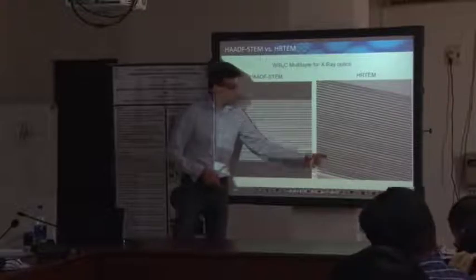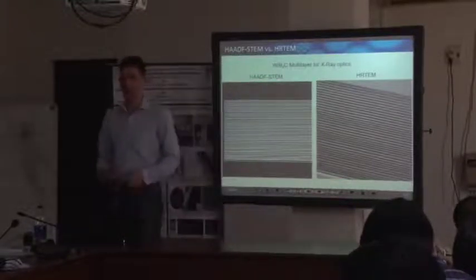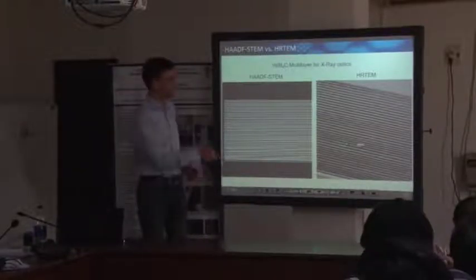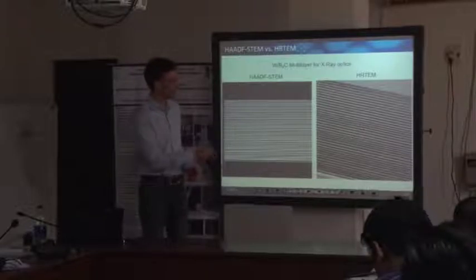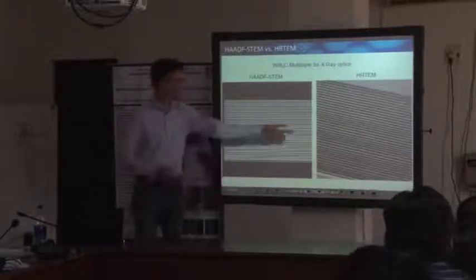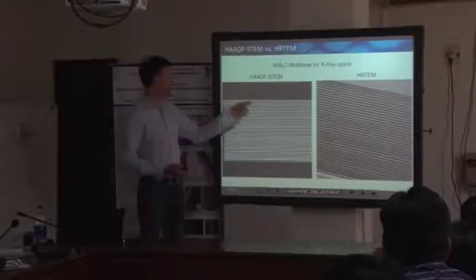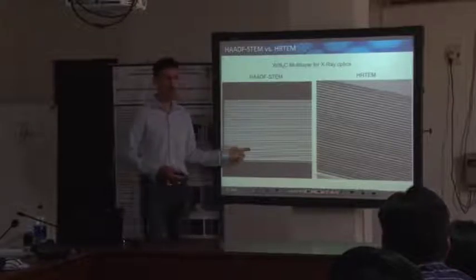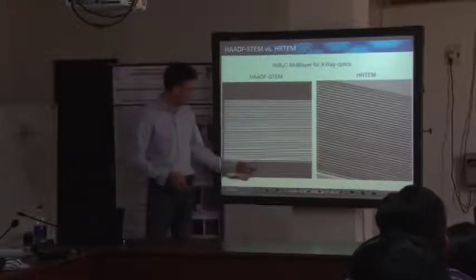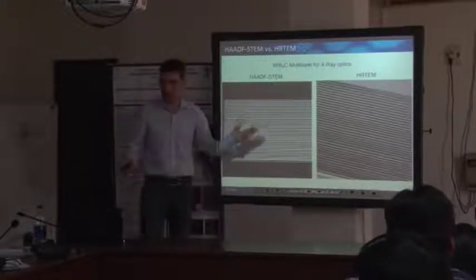The tungsten appears dark here in the conventional TEM due to Bragg contrast, and due to this very heavy atomic number the scattering probability is higher, and the very light interlayers appear bright. In Z contrast imaging, there is an inversion of the contrast because we need the atoms to scatter to these large angles. This is why the substrate is dark, and there is some hole which is dark too.